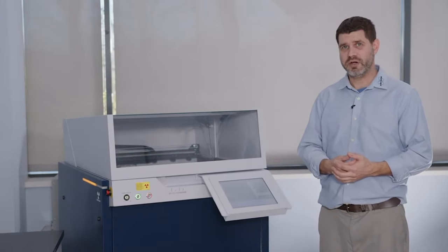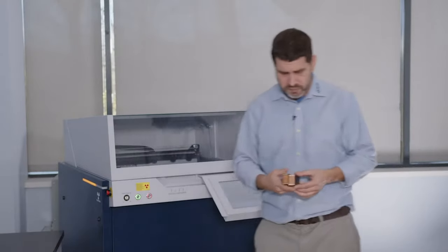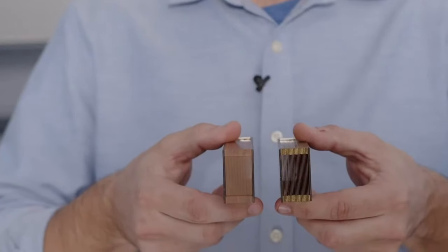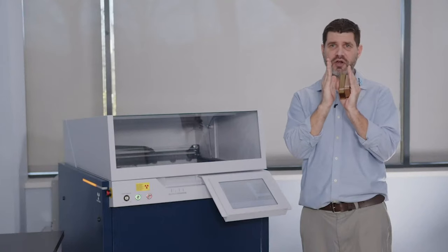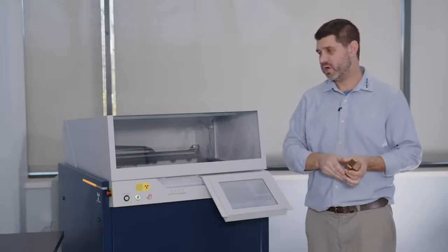Now, in this system here, we can add up to 4 collimators. The difference between the collimators, if we take a look at these, is that the planes inside there are parallel to one another. Now, if these planes are closer together, we get better resolution. If they're further apart, we get more intensity.